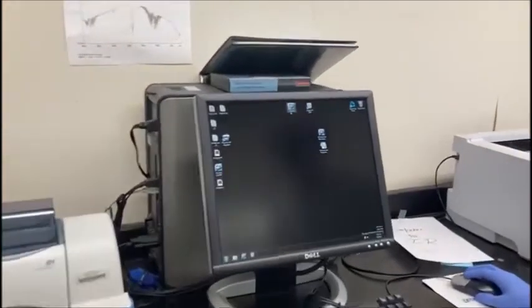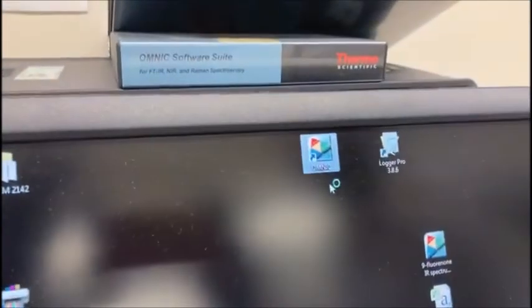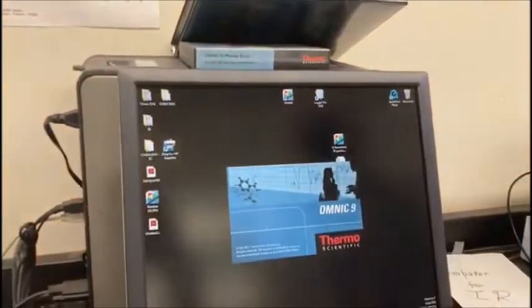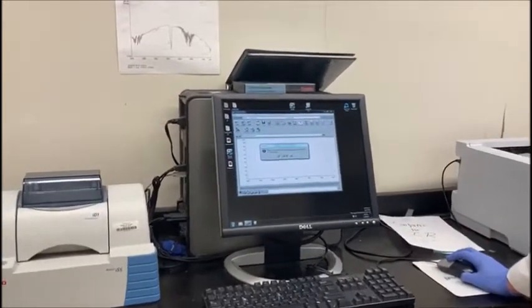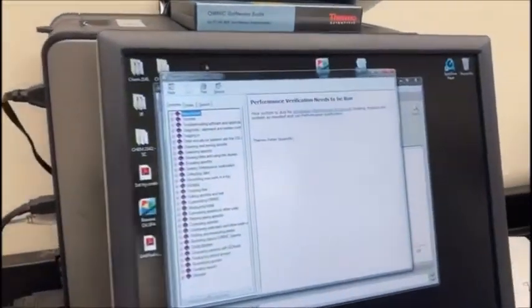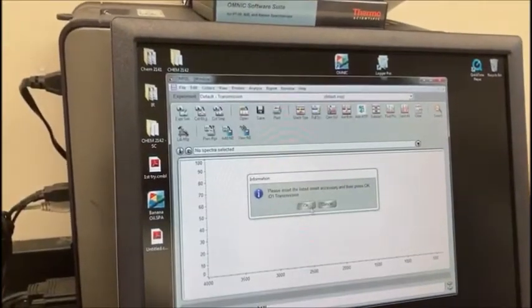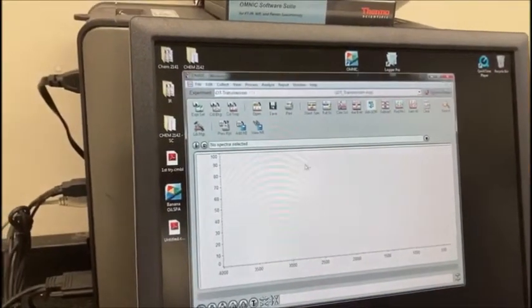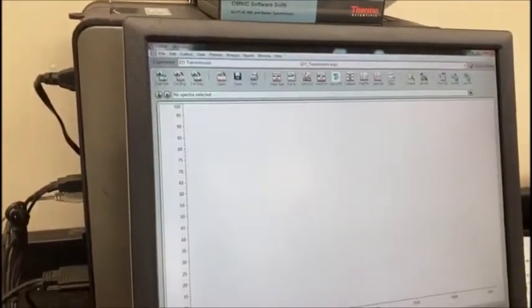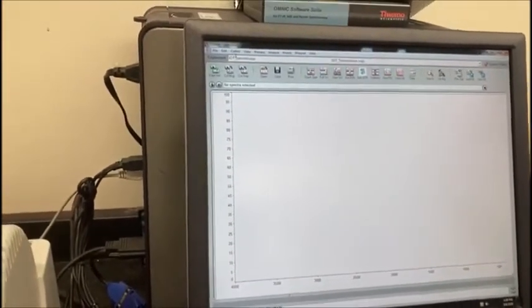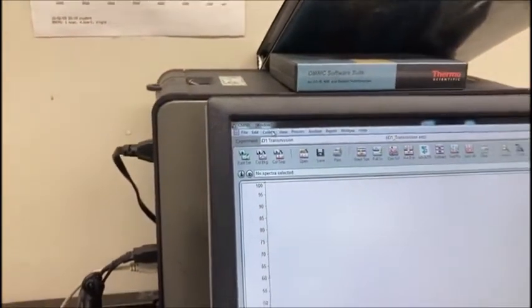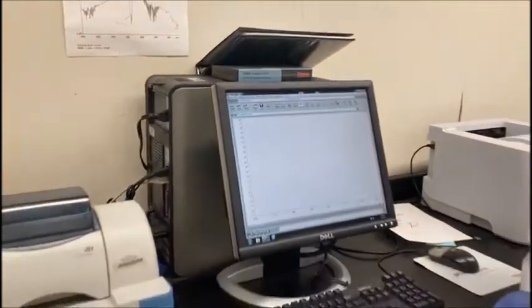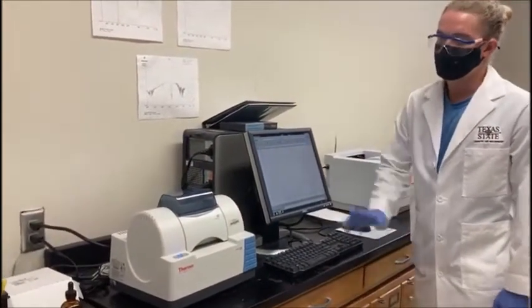We'll launch the Omnic software here. You'll get a bunch of pop-up menus.